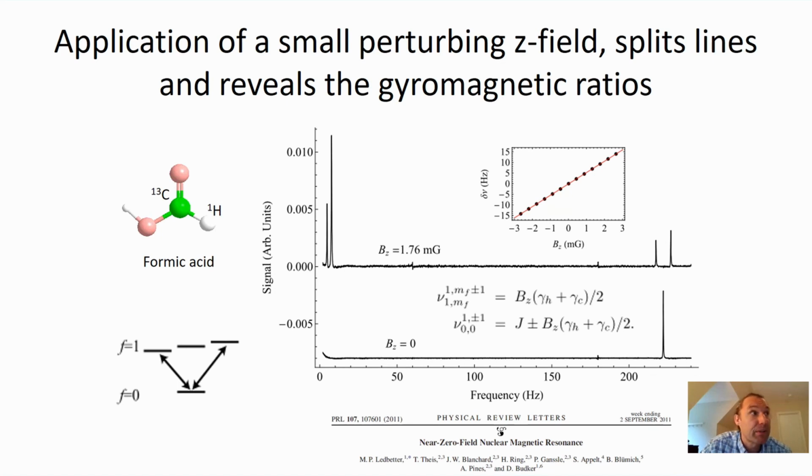Then you would still see this peak, which is simply the magnetization oscillating around the weak magnetic field that you're applying, which has very low frequency in this case. So one of them comes from the actual spin system and depends on the magnetic field that you applied and the level splitting that you've obtained, and the other one is much more trivial: simply magnetized protons oscillating about the magnetic field.